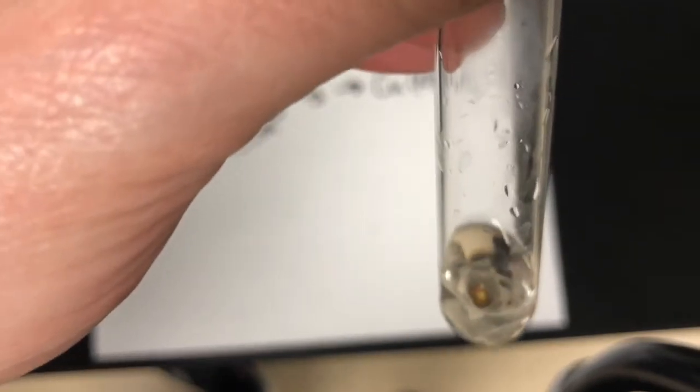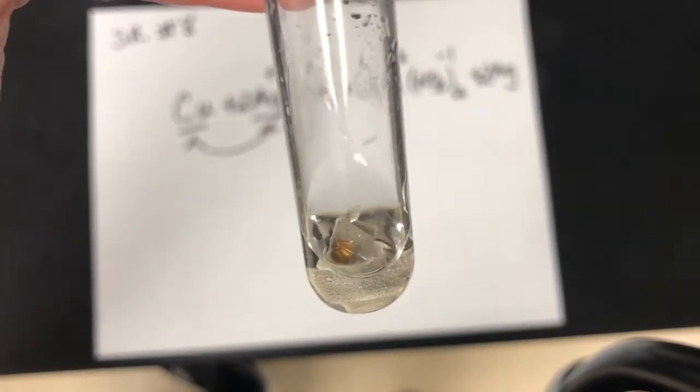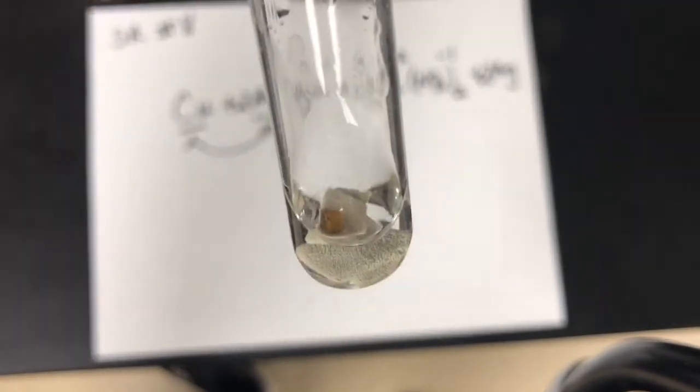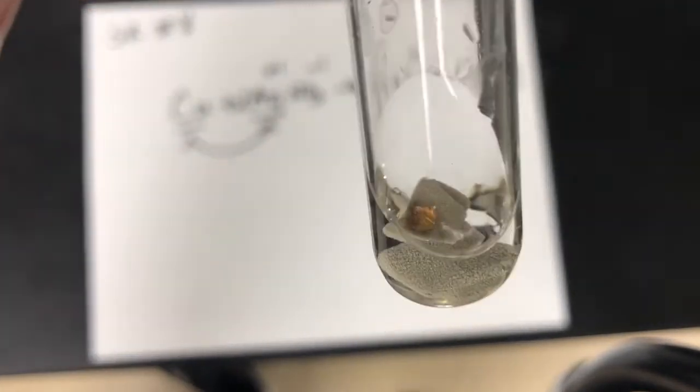Okay, so as you can tell, the copper metal doesn't look like it's copper metal anymore. Okay, the silver is plating out onto the metal. Okay, this is actually a really cool experiment. If you take a big long copper wire and you leave it in the silver nitrate for an extended period of time, you get these huge silver crystals that happen. So this is one of my favorite reactions.